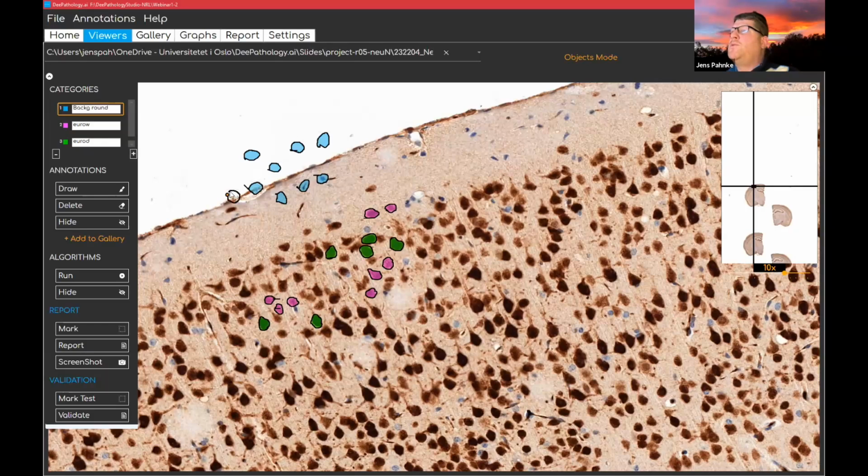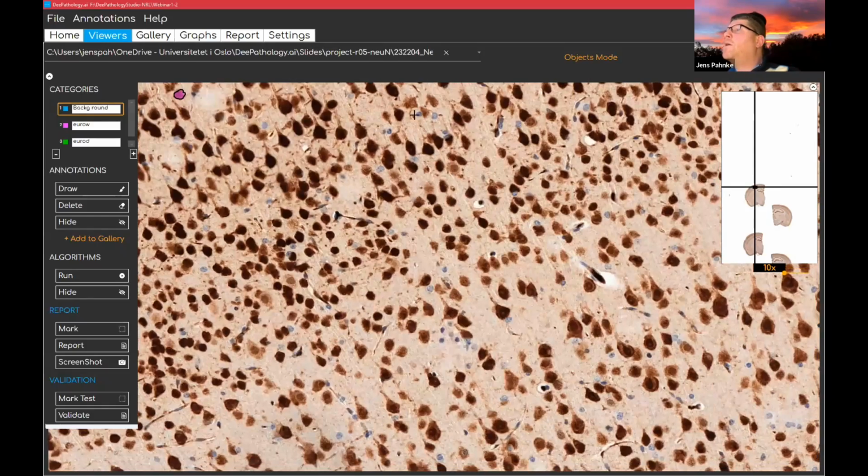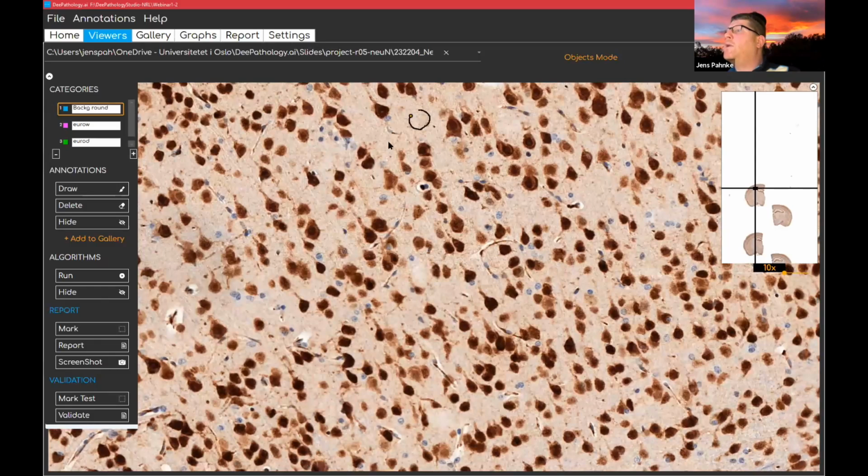It's very important that you choose proper examples of the background. The more, the better it is. It's not so difficult, just to give the software really a possibility to segregate from all the other things. Let's have a look what we find here. Some background. So some background here as well.